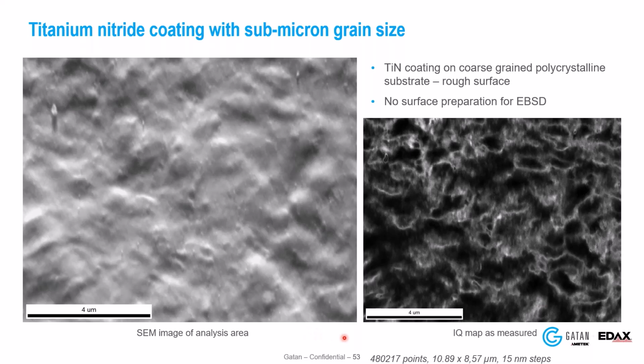But spherical indexing is more tolerant of decreases in pattern quality than the Hough transform. I'd never say that should be an excuse not to polish your sample. If your patterns are more blurry, your matching will have more imprecision than if they're sharper. But you can still get better results with spherical indexing than with Hough.